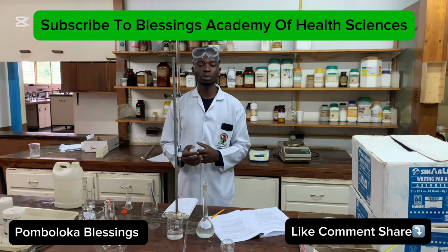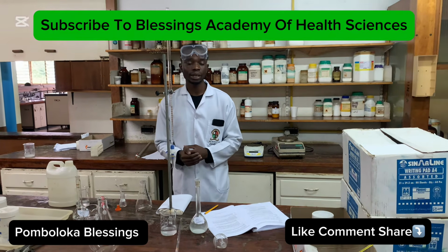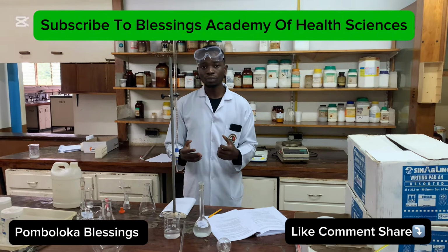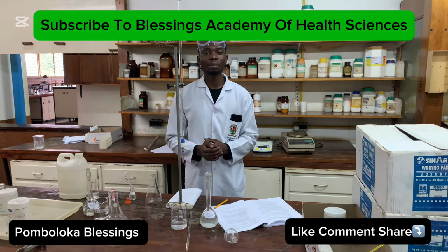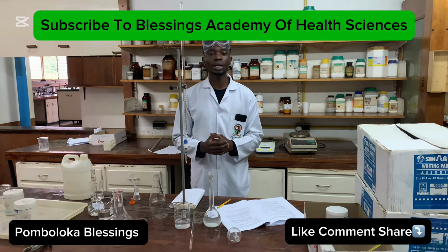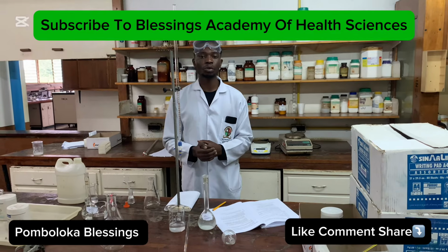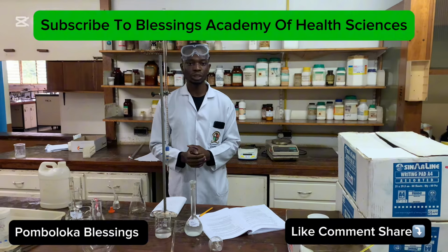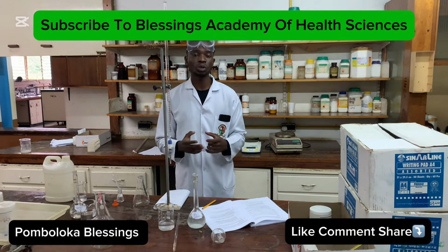Then the theoretical mass is found by first determining the density of ammonia, because we know that the density of ammonia is equal to the density of water, which is just 1 gram per cubic centimeter. And then we have the molar mass of the ammonia. So density is equal to mass over volume, and when you get the mass, we call that the theoretical mass. To find the percentage of the ammonia in the household ammonia, you take the actual mass over the theoretical mass, multiplied by 100. So that is how you work out the entire lab session, and that is how you do your data analysis.